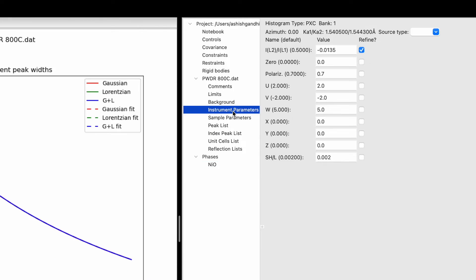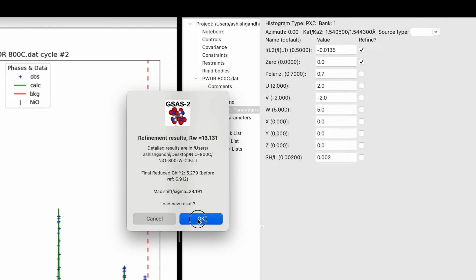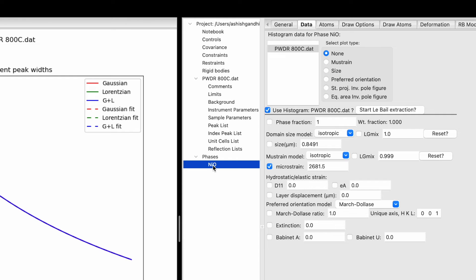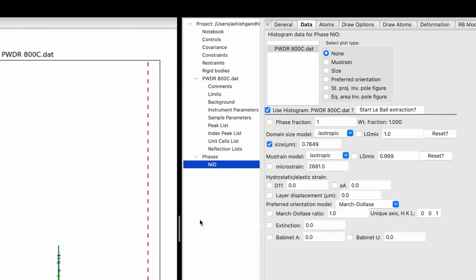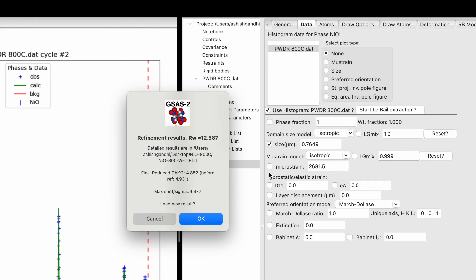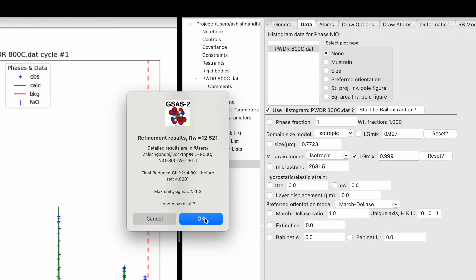Now go back to the instrument parameters and click on the refinement for zero. Click Command+R and we will see it has reduced to 5.27 — that's getting better. Come back to NiO. Try with microstrain — 4.9. Size is getting better. One more time — 4.8. Check LGMix again. Keep trying and make sure the parameters are within the permitted values — 4.8.